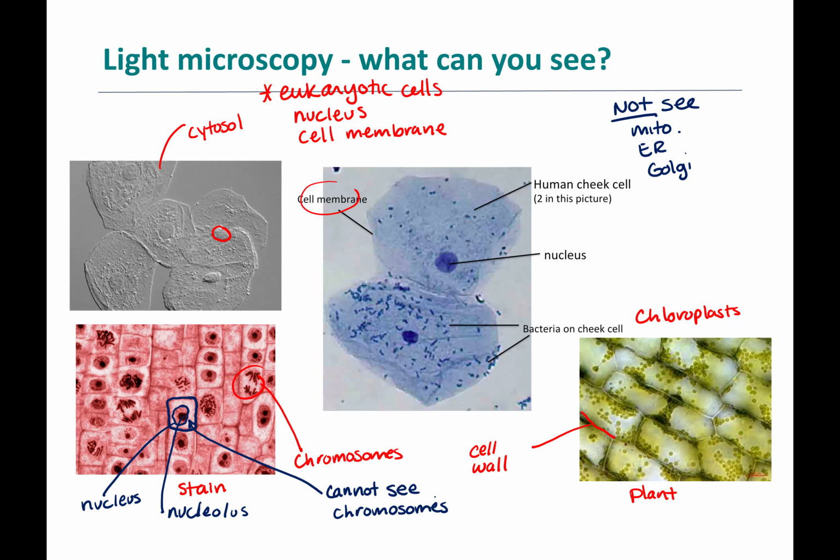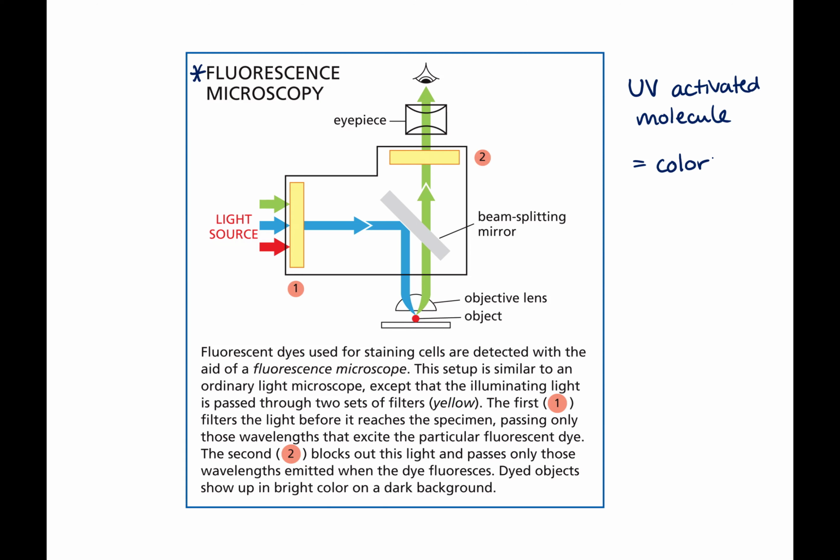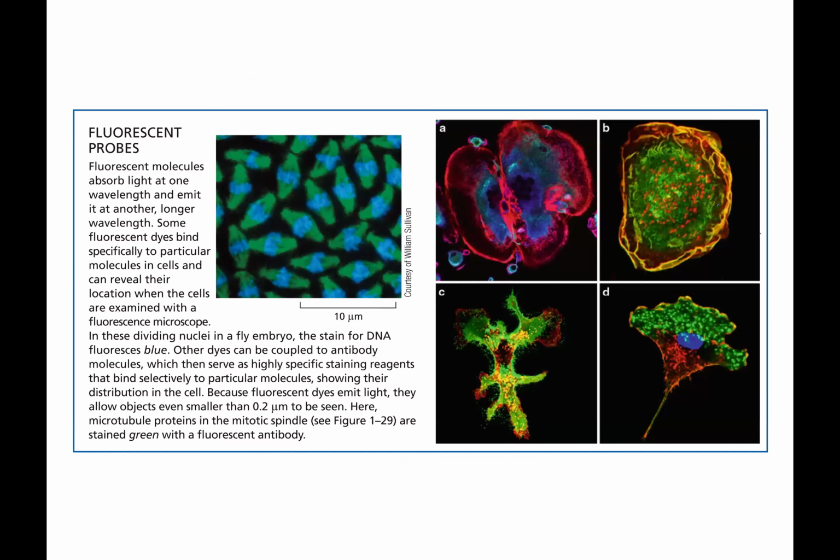So again, this is a type of light microscopy, but we're always going to refer to it as fluorescence. And these are always dead, because to get the fluorophores in there, or I'm going to tell you about antibodies in a minute, you have to kill the cells so you can get these big molecules inside. So fluorescent probes is what I'm talking about, or a tag.